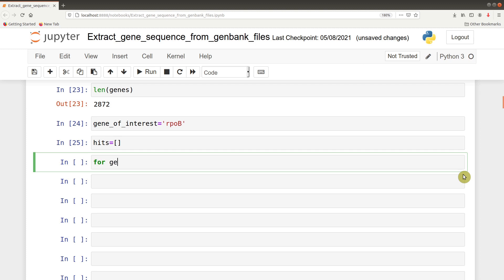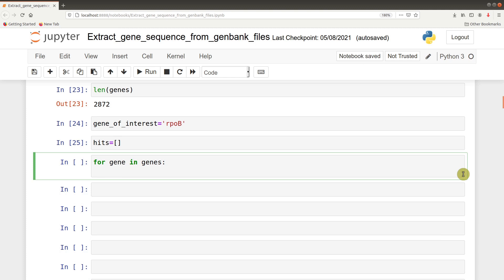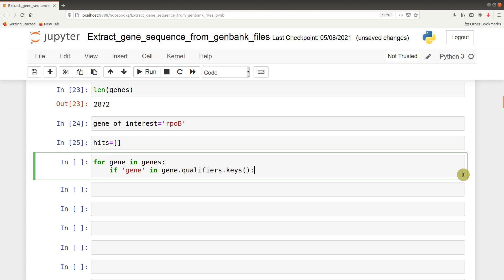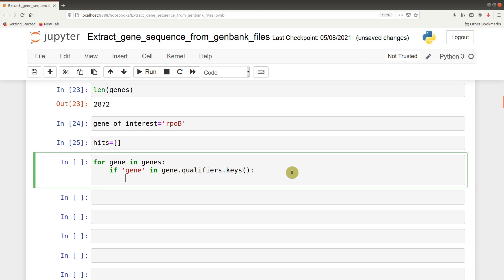Now we proceed with the iteration. We say for gene in genes, if gene in gene.qualifiers.keys. Here we're looking for additional information in the GenBank file. If it's a gene, we should have this information there. Using that information, we'll now get the rpob. Once we have this if statement, we move to the next line. If we have that key with the name gene, we probe further to find the name.